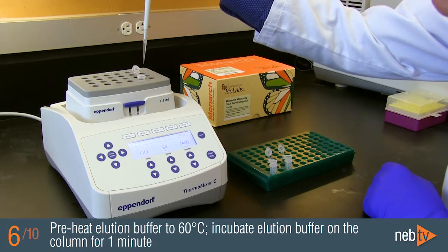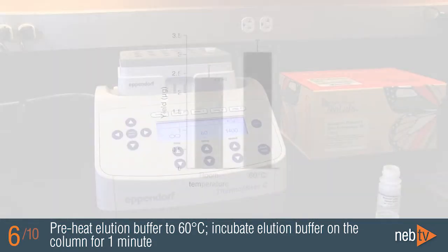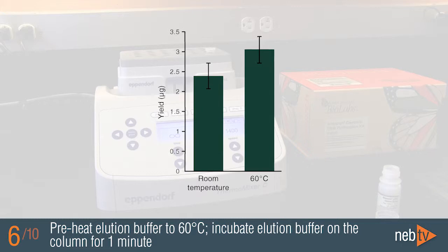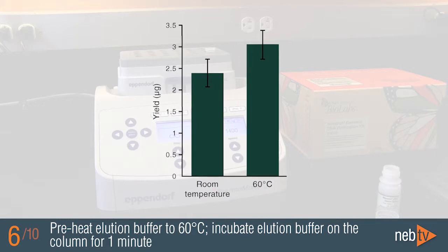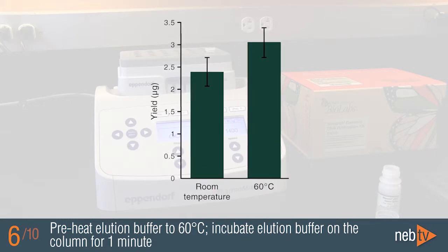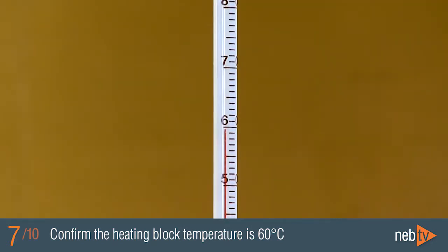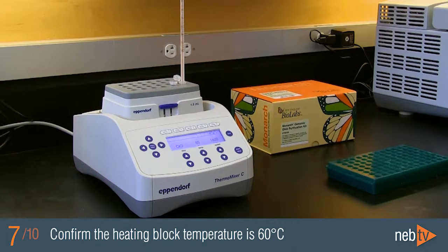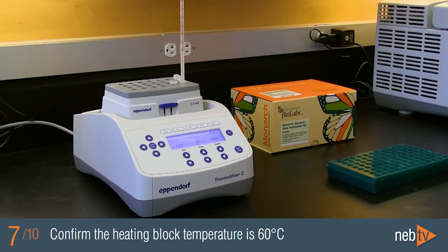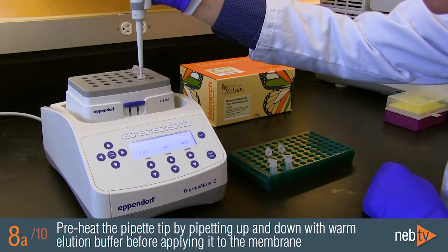The Monarch kit employs a warm elution step, where the column is incubated for one minute with elution buffer preheated to 60 degrees Celsius. Preheating the buffer increases the efficiency of elution, ensuring 80-85% of the genomic DNA elutes from the column in a single step. Ensure that the elution buffer is 60 degrees Celsius — cooler buffer will reduce efficiency and thus yield. If the buffer is above 60 degrees Celsius, the DNA may be partially denatured. As heating blocks may not be accurate, we suggest confirming the temperature of your heating element by filling a tube halfway with water and inserting a thermometer. It can also help to warm the pipette tip prior to transferring the elution buffer onto the membrane by pipetting up and down a few times with the warm buffer.